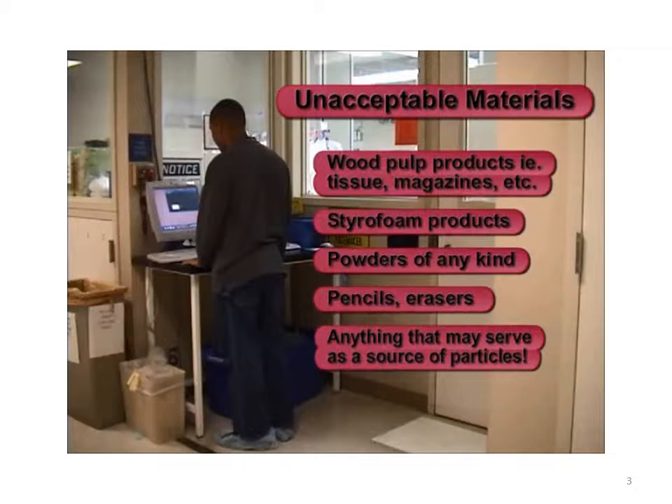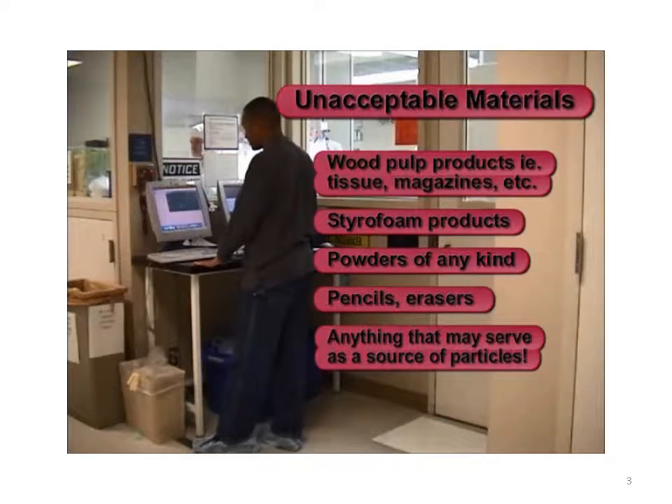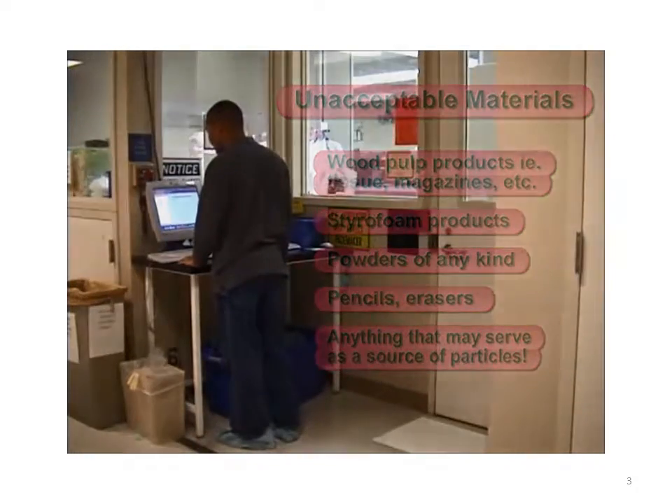The following are unacceptable materials: wood pulp products such as tissues and magazines, Styrofoam products, powders of any kind, pencils, erasers, and anything that may serve as a source of particulates.